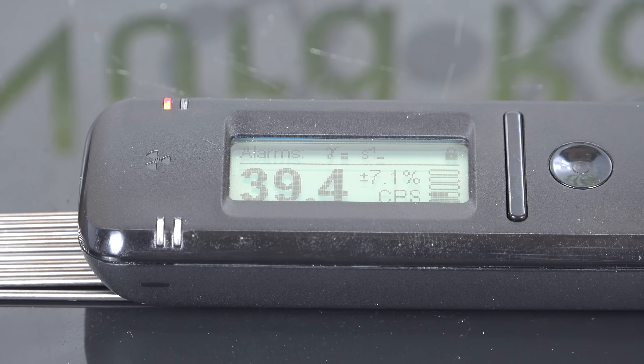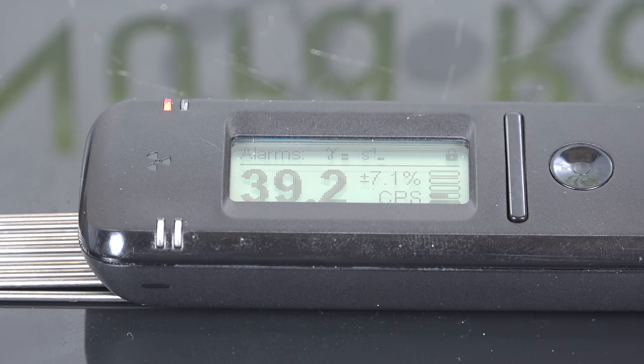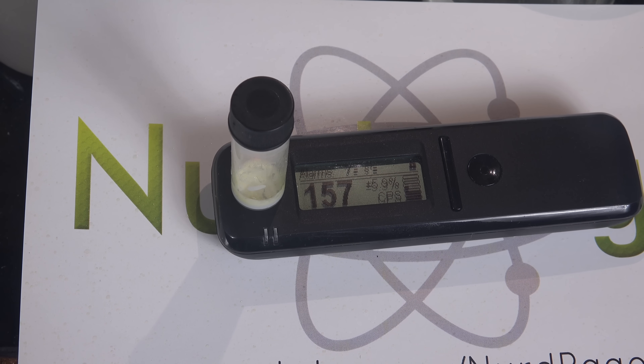These thoriated tungsten rods are good and easy to get, but they only have about 2% thorium in them. Additionally, because they are alloyed with tungsten, a very dense heavy metal, some of the radiation is attenuated by hitting the tungsten before it can escape to the surface. So to get a stronger signal, I'm going to concentrate all the thorium in these tungsten rods into a vial and remove most of the tungsten.